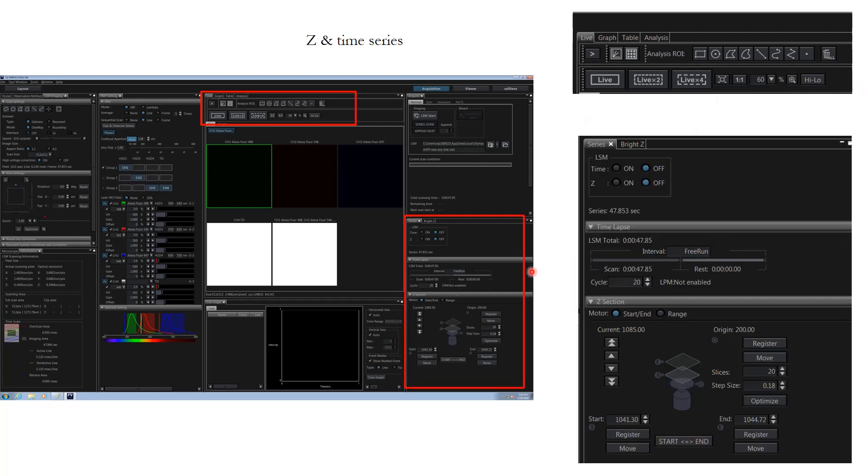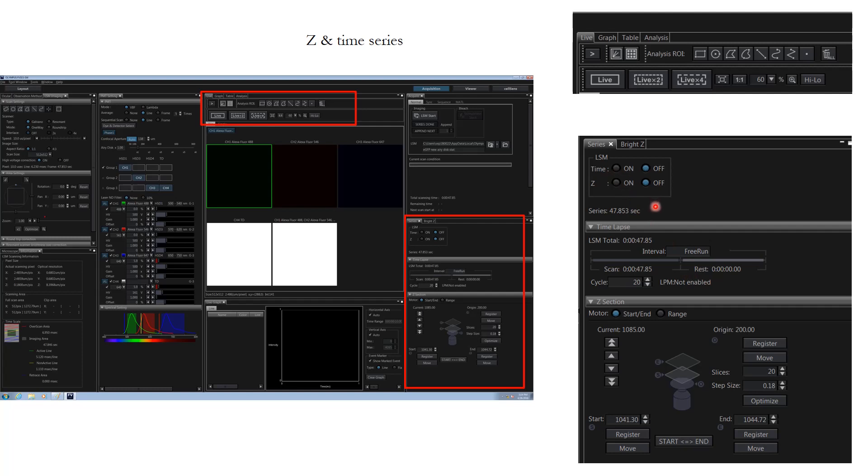Now if we see this area, this is where you can set the time and the Z. For setting up time you have to check this option on, and then you can set up the parameter like interval, how many seconds you want, up till how much time you want to do it. This way you can set up the parameter for time series. Similarly for Z, all you have to do is click on here, and then you can move the focus down to the lowest focal plane and click register. Similarly you can move the focus up to the topmost plane and click register, and this way it will be registering both the start and end points.